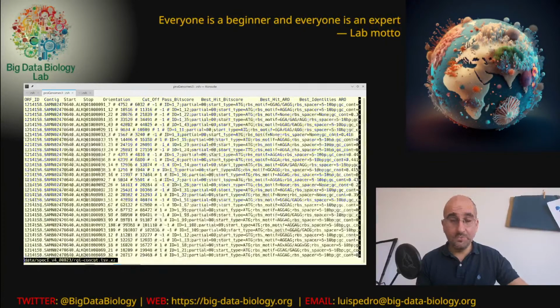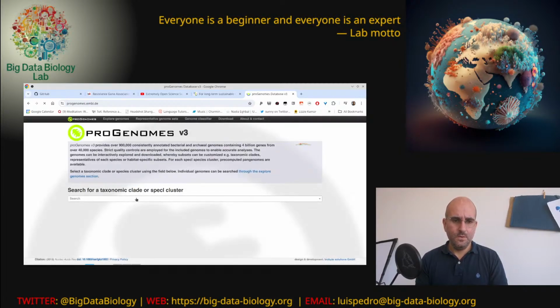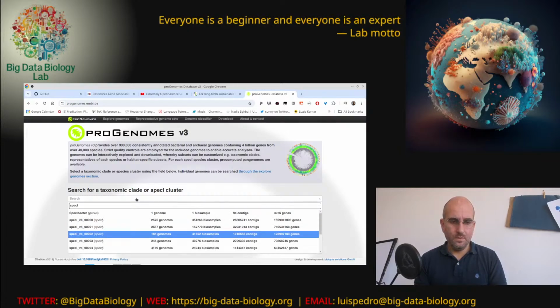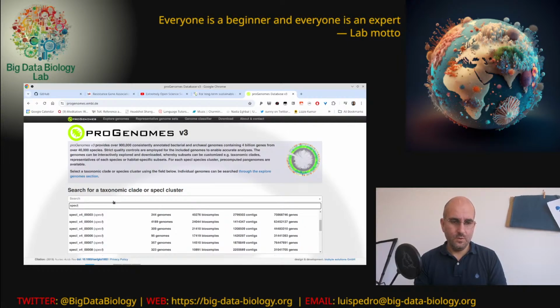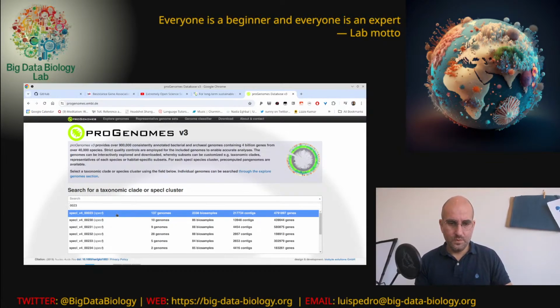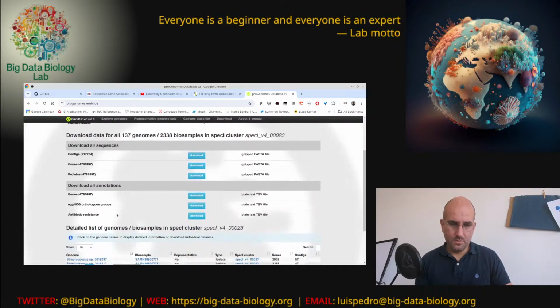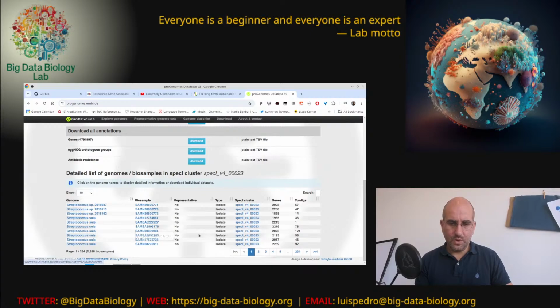SpecI 23, which I don't know what it is, out of curiosity. Okay, it's mostly a Streptococcus, some Streptococcus suis.